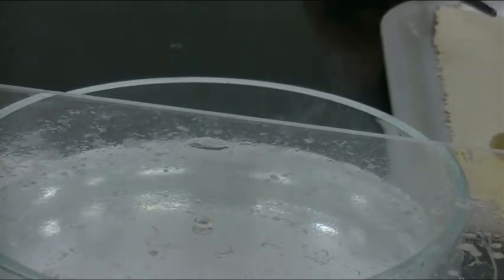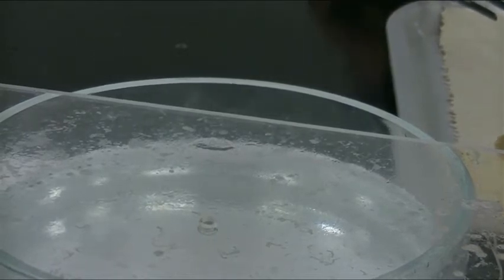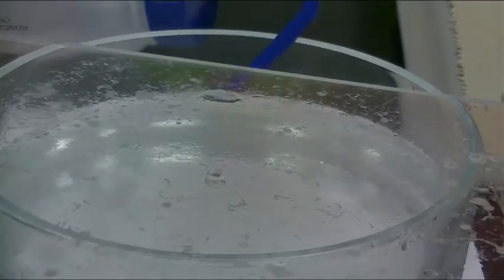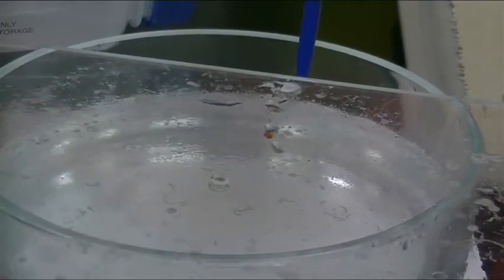Hydrogen gas. Hey, what would happen if you lit a match above that, Dr. Yates? That's called a bad idea. Oh, it's called the Hindenburg Part 2, Hindenburg baby. We already did hydrogen last week. He's like running away from you. That's like a duck on steroids. It's a lot faster than the previous duck.